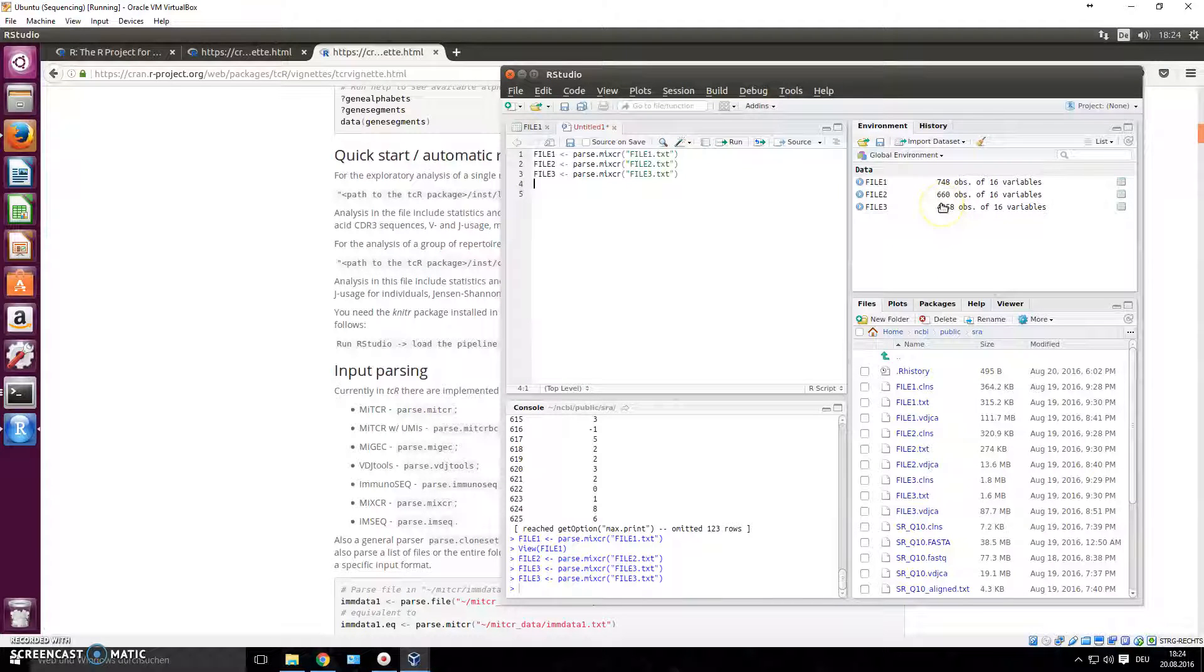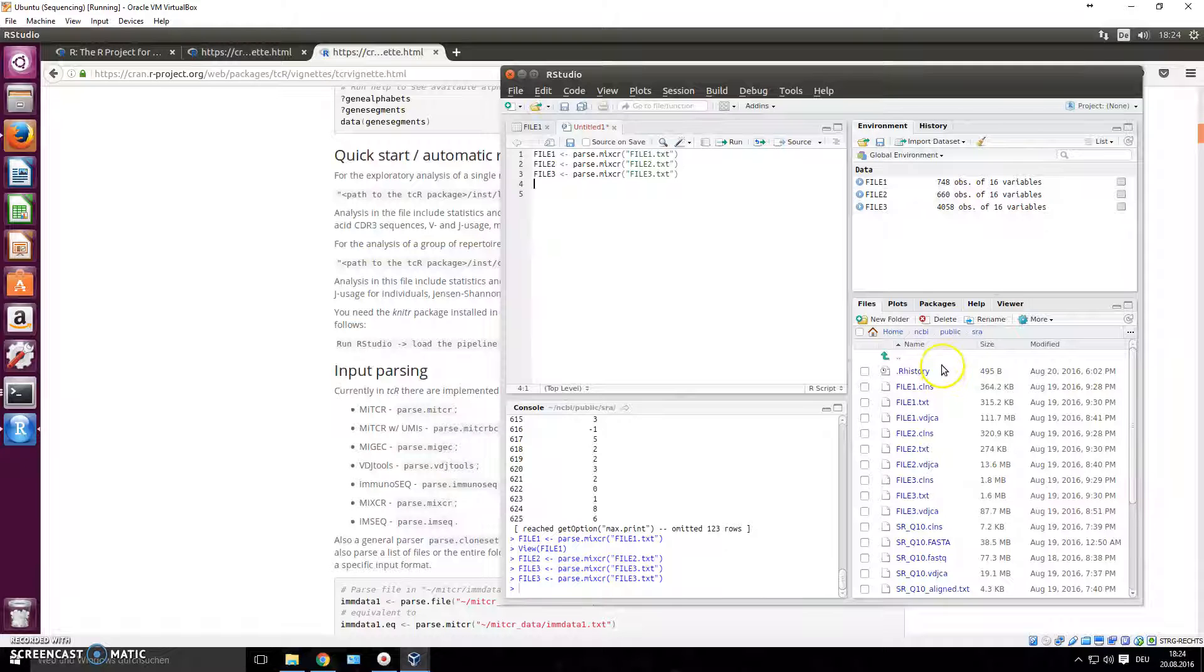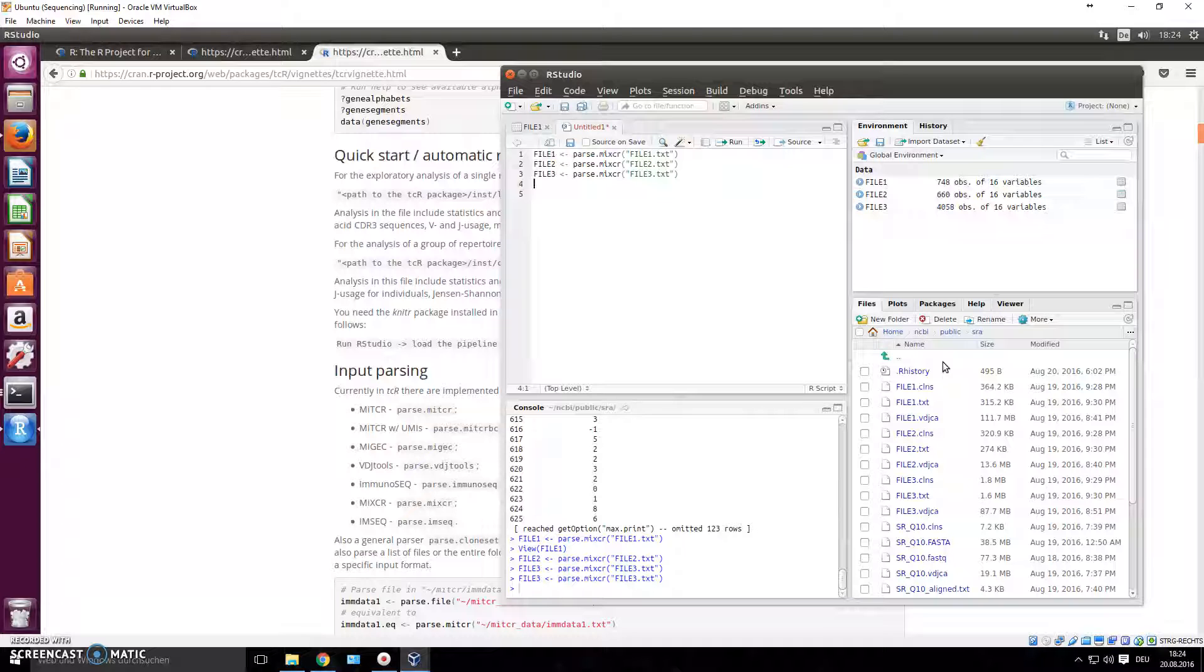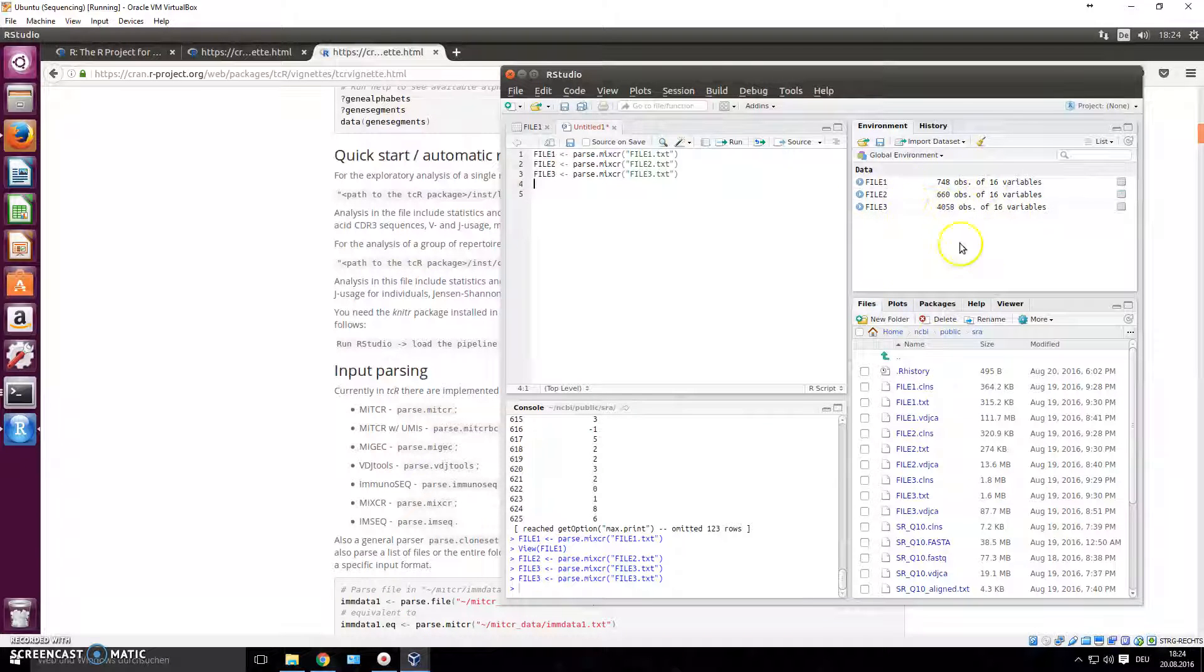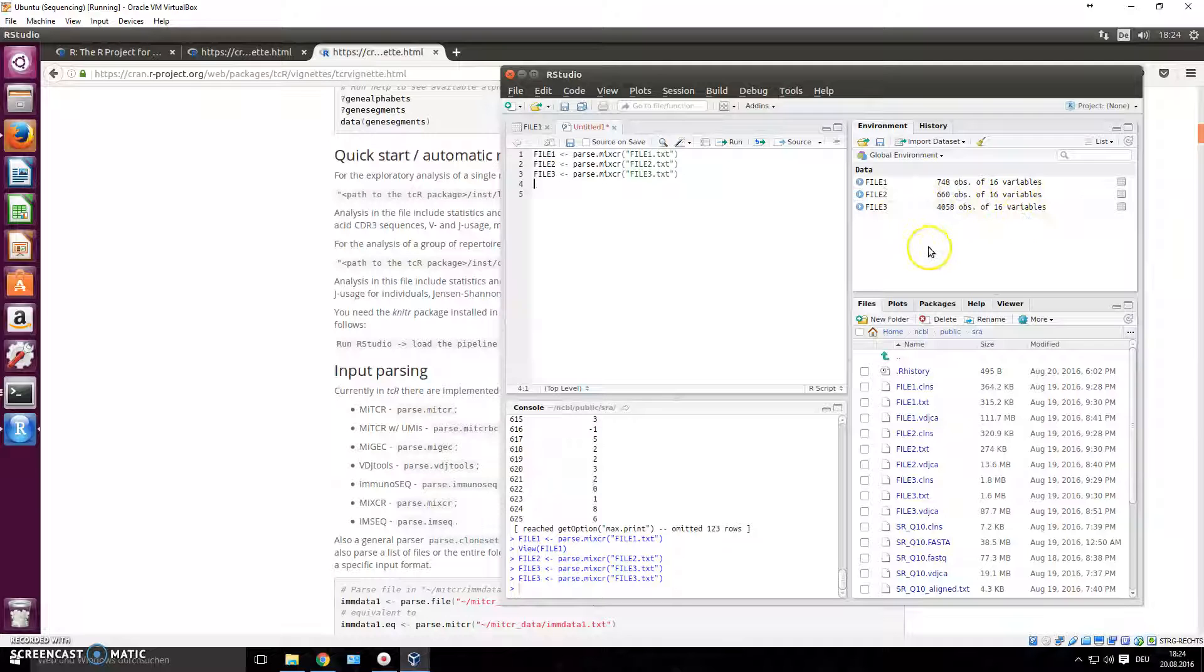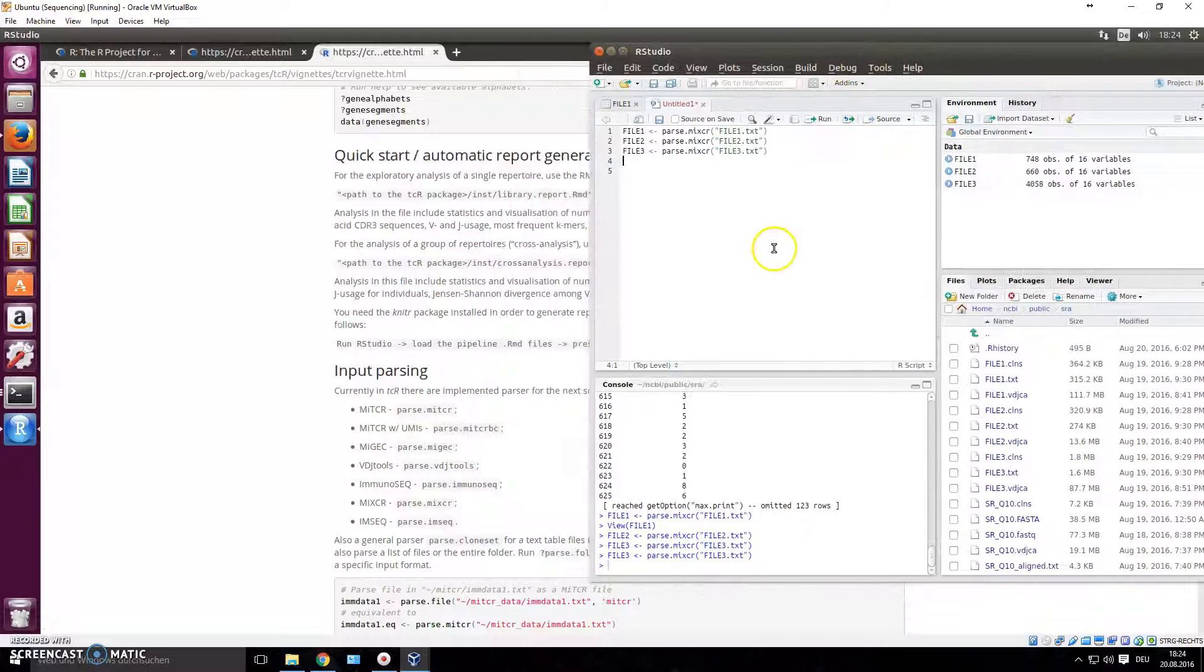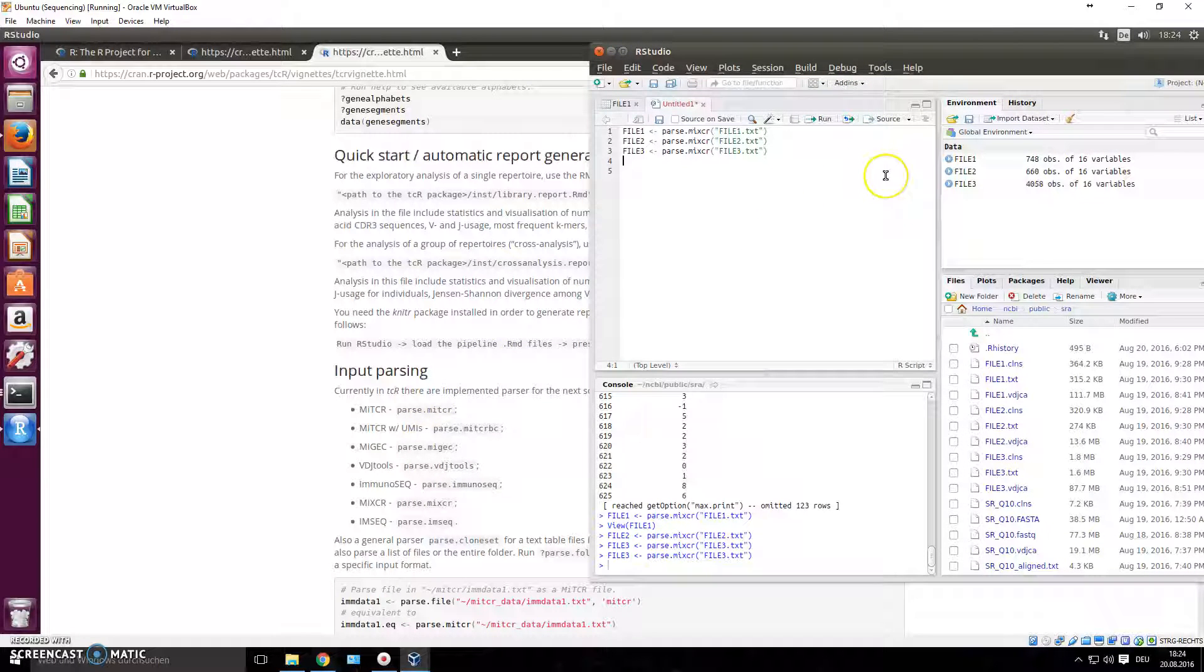All three of these don't have a lot of clonotypes. Usually if you have sequencing data you might - you know, this is obviously some special mouse. The data that we got was from a transgenic mouse, it was sorted regulatory T-cells. So in all of those cases, those probably are the reason for why you have limited amount of clonotypes. But that's not important.